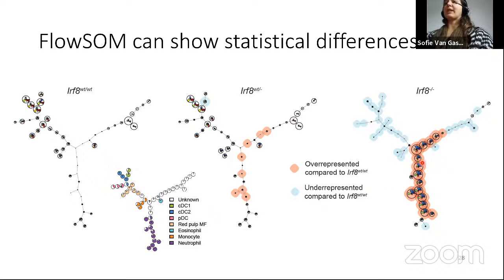When the researchers then looked further into it, these seemed to be neutrophil precursors, so they were not explicitly gated in this panel. And actually, this kind of exploratory approach can give you these extra insights, which you might miss if you just look at the manual gating, only looking at the cell populations you expect.